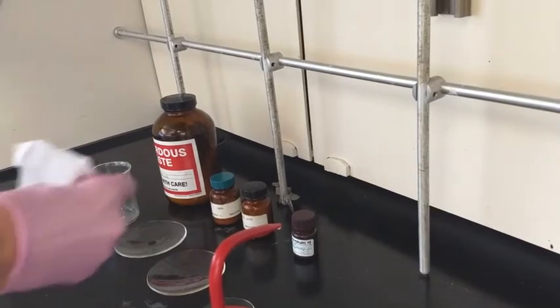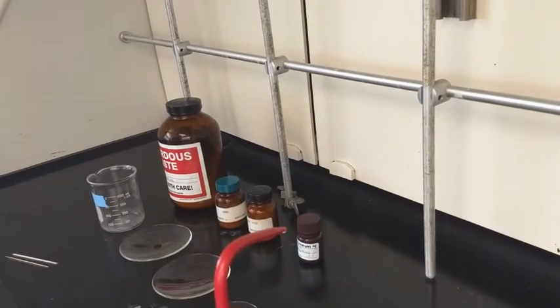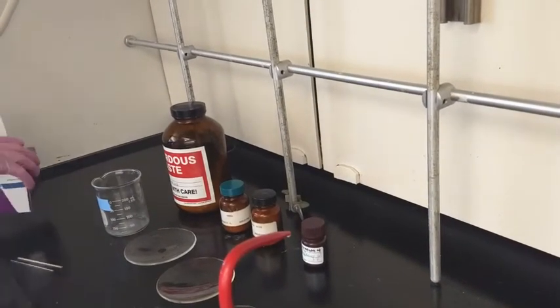Acetone will evaporate really quickly. Remember, this is in the hood where all the air is moving, so that makes it even faster.